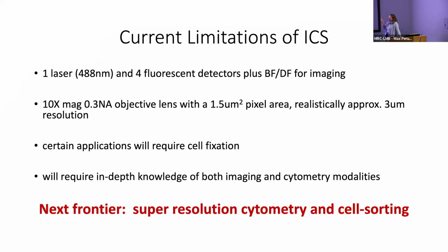Realistically, I think initially when they released the machine, they were advertising approximately 1 micron resolution. From what I hear from colleagues, it's more like 3 microns resolution. So we're not really getting super resolution cytometry here. Certain applications will require cell fixation, so that negates any kind of purification of anything live.